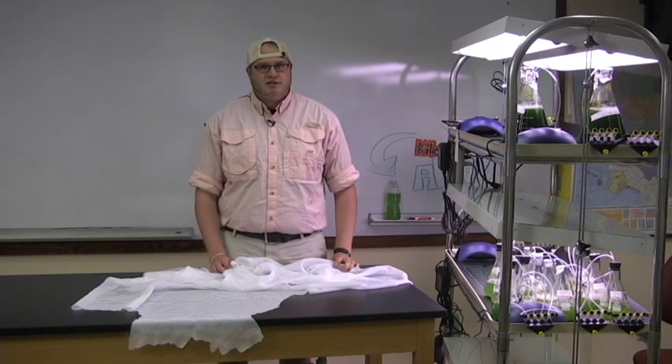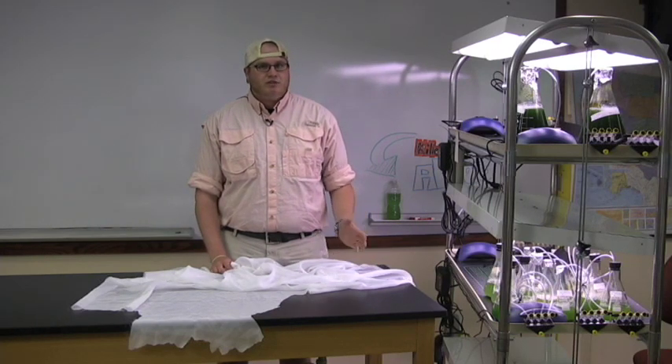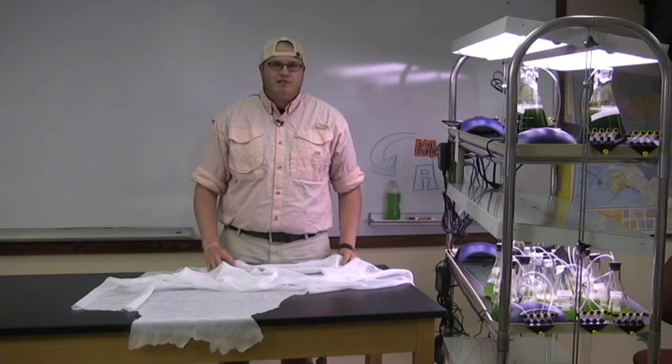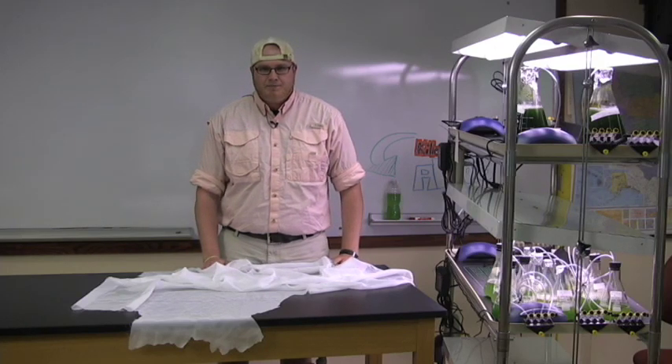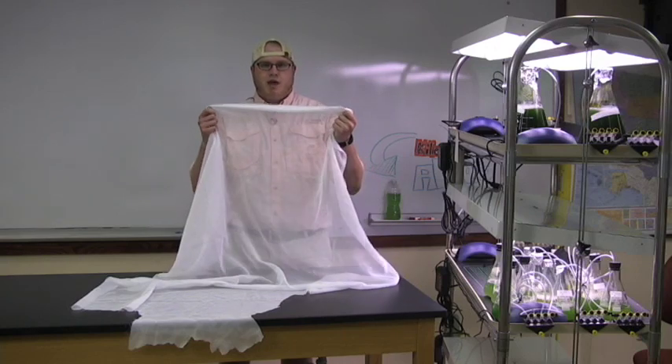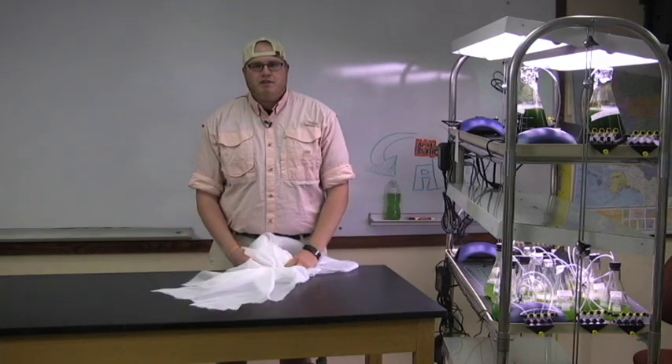Algae can also be grown on a window sill, though this gives you little control over light duration and intensity. Another potential setup for your classroom is an outdoor diffused light setup. We built a small growth chamber and covered it in a semi-transparent mesh. A diffused setup evenly distributes incoming light and provides a small amount of protection from disturbances such as rain and wind.